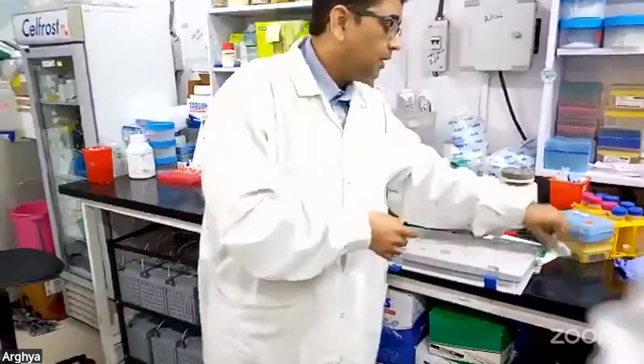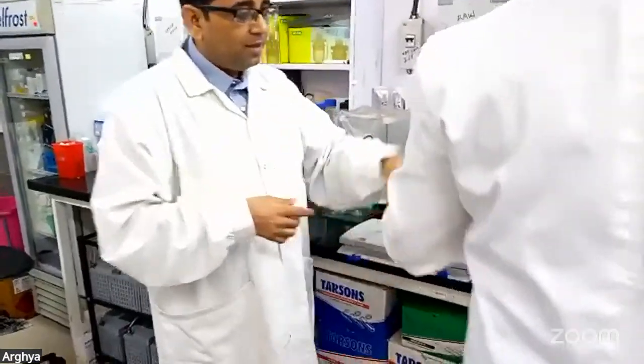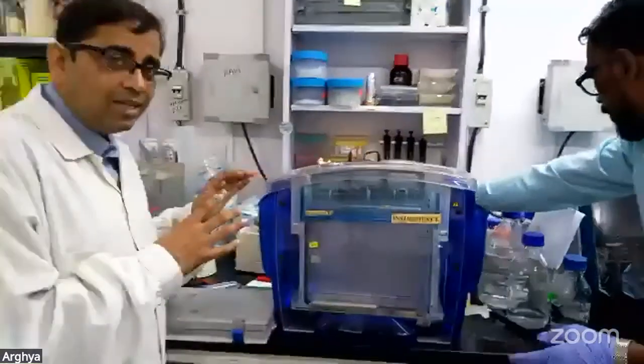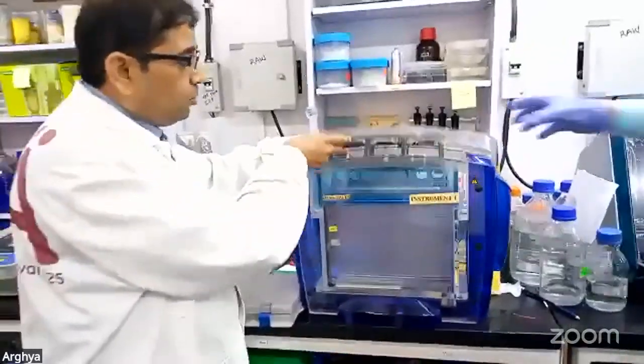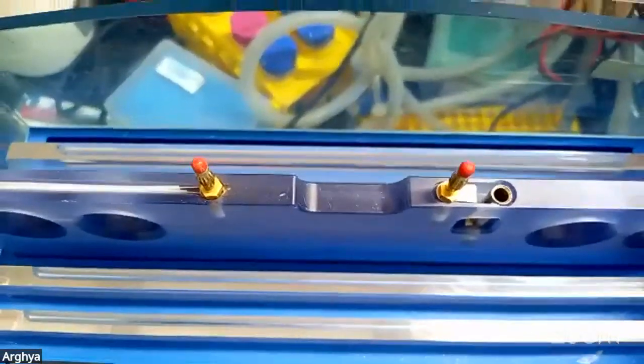So then we are going to utilize for the 24 centimeter IPG strip a big unit, which is known as the Ettan DALT unit. In that unit, we can run 6 gel separations simultaneously. For example, what you see here is the big setup. This we don't use routinely, we only use it when we have 6 gels to separate. So, if you can come closer, Angela, what we can show here is that 6 large gels can be kept in this particular setup.